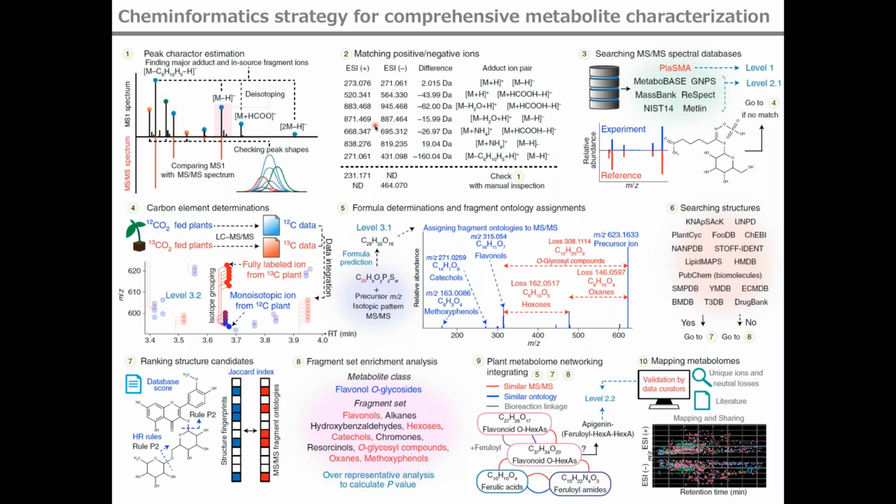In electrospray ionization (ESI)-oriented metabolomics, one metabolite can be detected as various ion types, including isotopes, different adduct types and clusters, and in-source fragment ions.